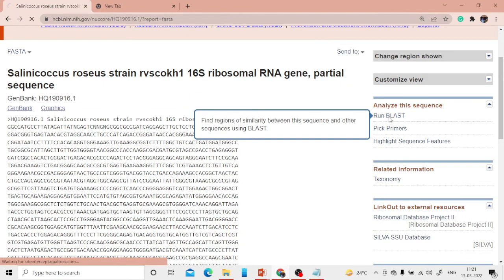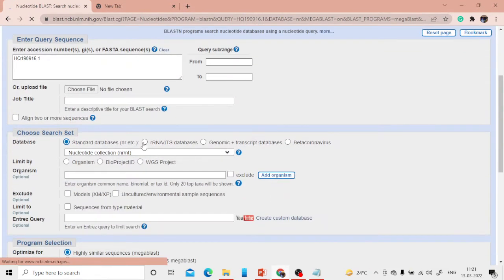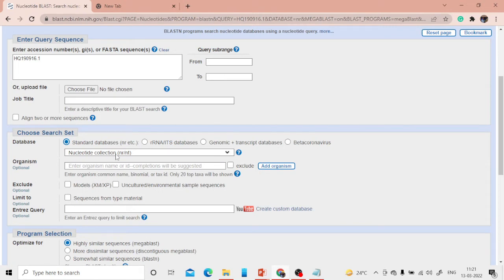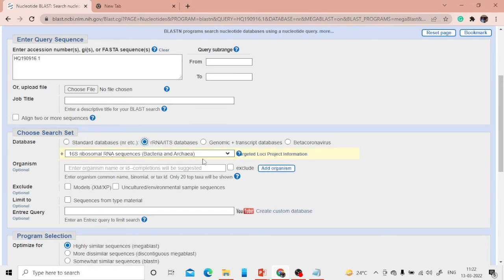Running BLAST will search for homologous sequences. By default, using the nucleotide collection may return unnecessary results matching human, bacteria, viruses, or fungi. Since 16S rRNA is present only in bacteria, I'm restricting the database to rRNA to avoid false positives. If you have a eukaryotic gene sequence, keep the standard database NR — it depends on what type of sequence you are searching for.